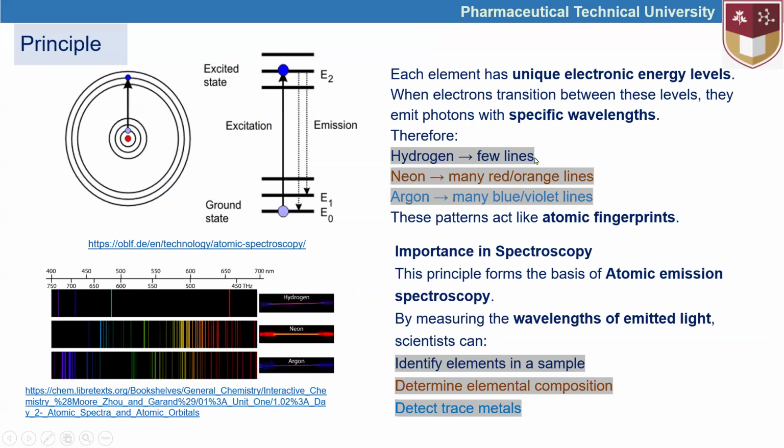Okay, next. And here we can see the excited state of electrons, and the electrons can go back to different electron shells, based on which we can see different bands as indicated here.